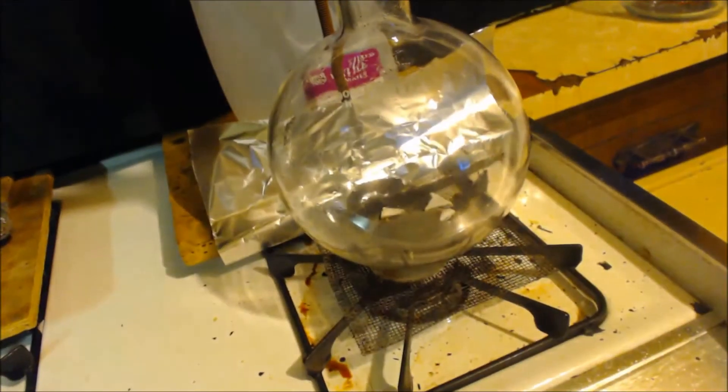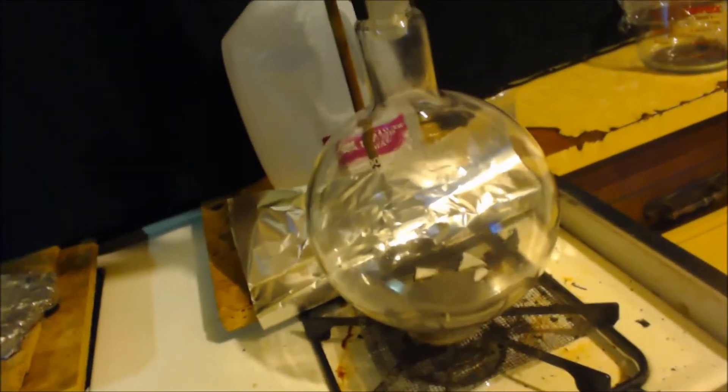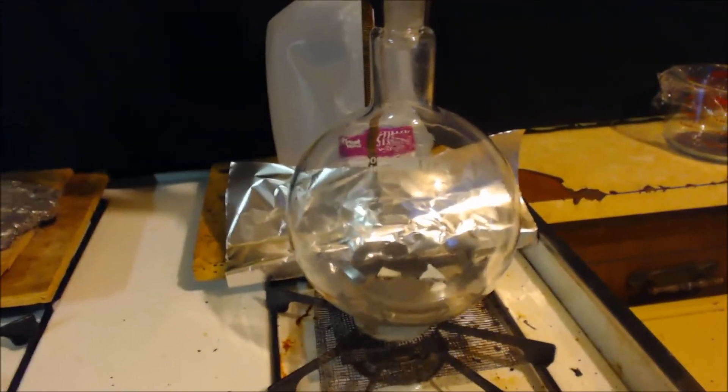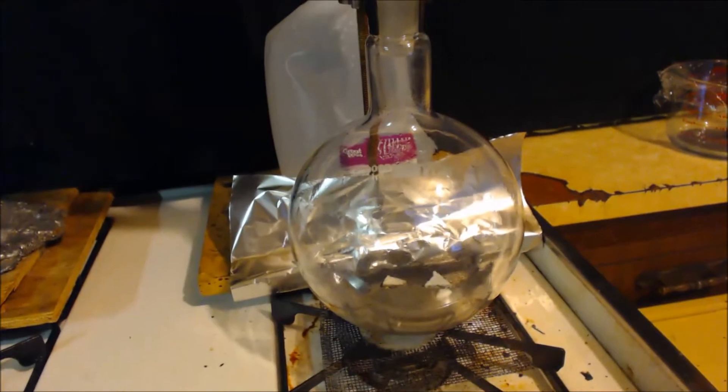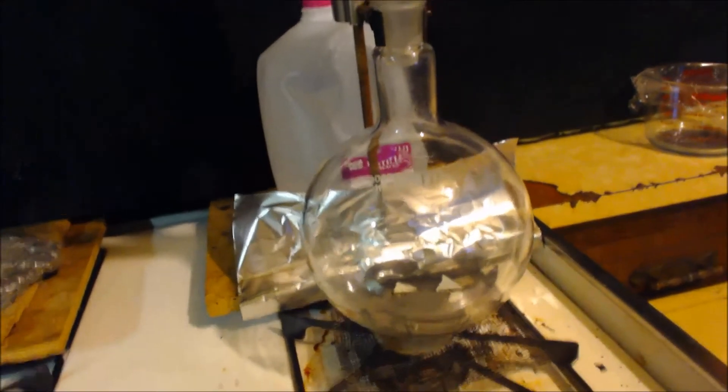And then here I've got a Vigreux column and a condenser. And up on the top, I've got a little thing here just so it can vent. Oh, I better open the valve. So it can only come out that little hole there. It's overkill, I admit, but I'm just going to drip it in. We'll see what happens. This one though, I figure I've got to recrystallize it, so I'm going to add like 150 milliliters of water, maybe 100 milliliters or something like that.